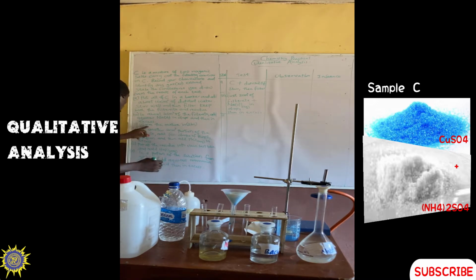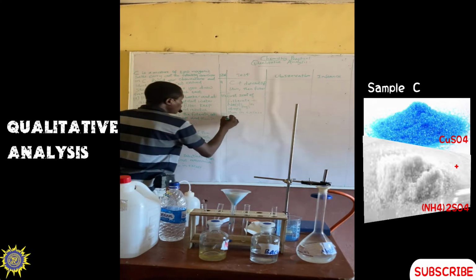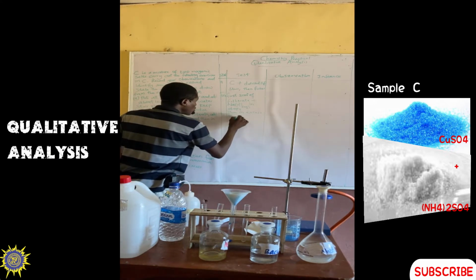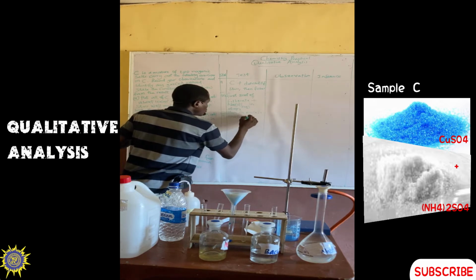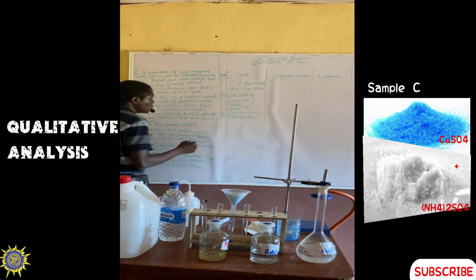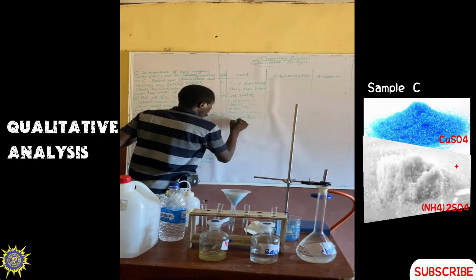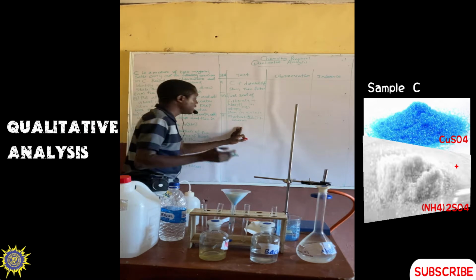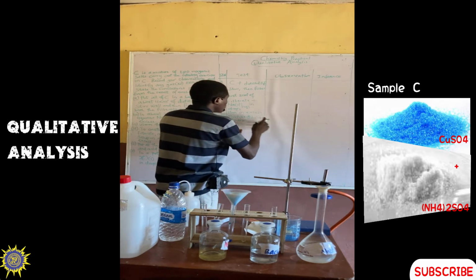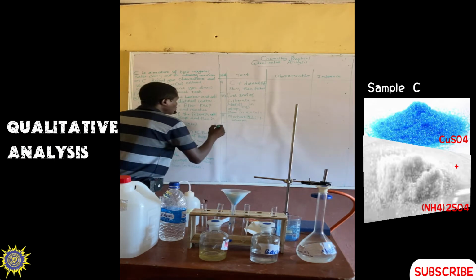We are now told to warm the mixture that you obtain here. So warm the mixture in 2BI, because the question is about 2, so 2BI plus warm or heat. When they say warm, they are trying to say you should heat it. So now what's your observation and what's your inference?